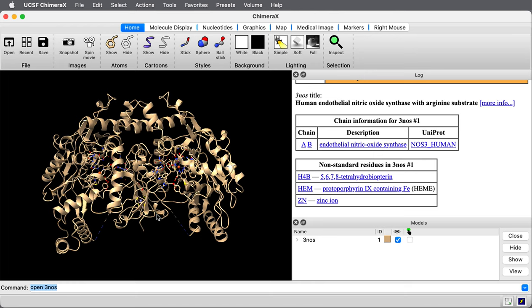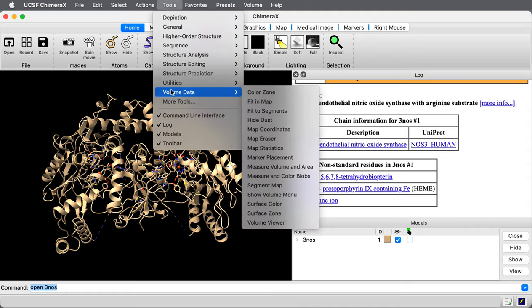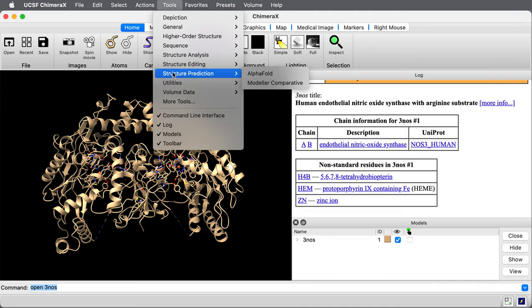This is the experimental structure from X-ray crystallography. Let's see what it looks like from the AlphaFold database. The protein databank has a database of structures predicted by AlphaFold and we're going to bring one of those up.